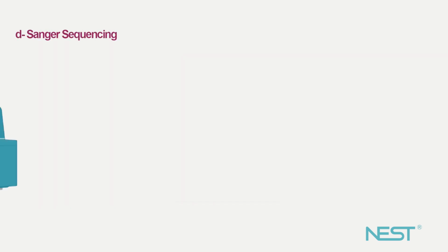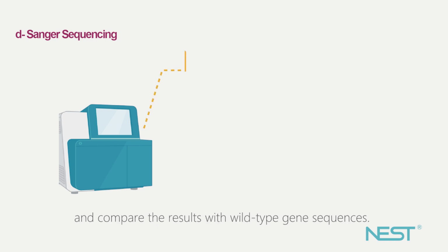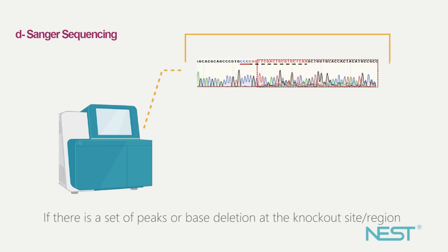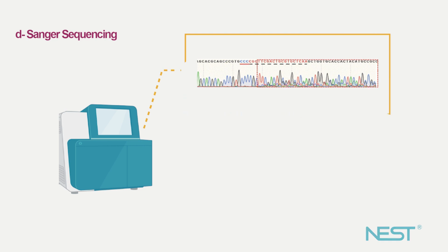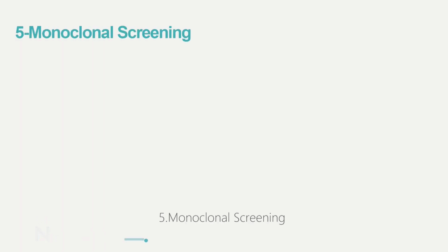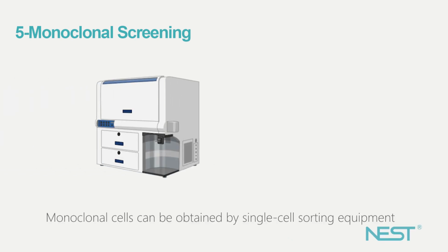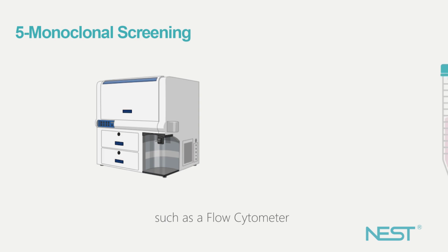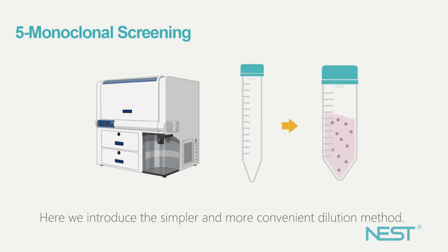Sanger sequencing. Do the Sanger sequencing on the PCR products and compare the results with wild-type gene sequences. If there is a set of peaks or base deletion at the knockout site or region, monoclonal screening will be continued. Fifth, monoclonal screening. Monoclonal cells can be obtained by single-cell sorting equipment such as a flow cytometer, or by limiting dilution method. Here we introduce the simpler and more convenient dilution method.